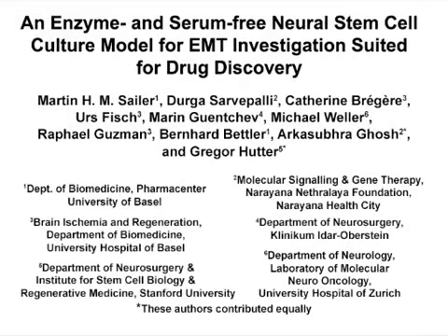The overall goal of this procedure is to induce migration in typically non-migratory cells to identify specific compounds that activate or block migration. This method can help to answer key questions in the field of cell migration and invasion and may be of particular interest to scientists working with neural stem cells.